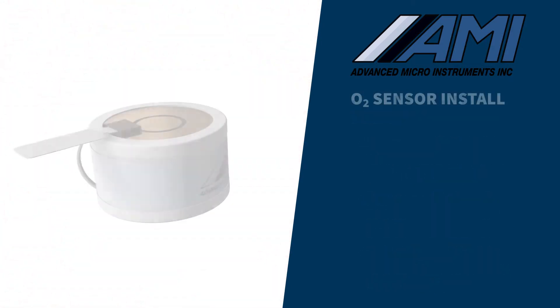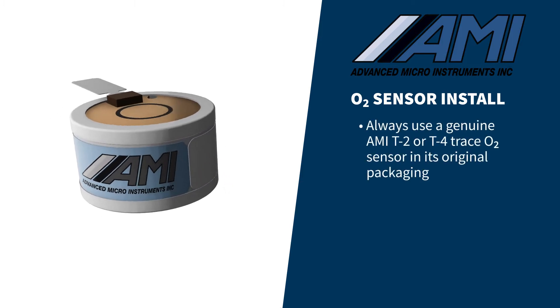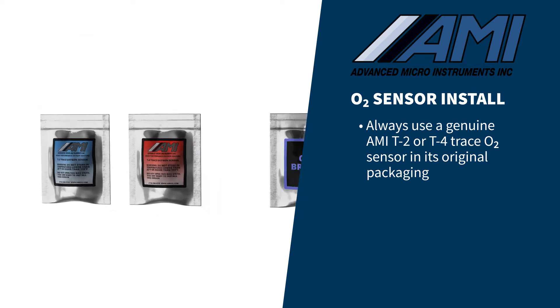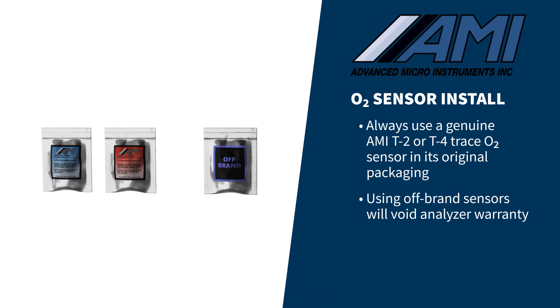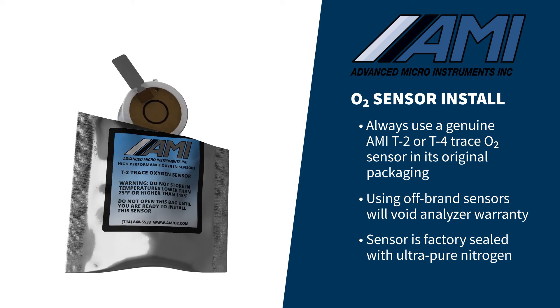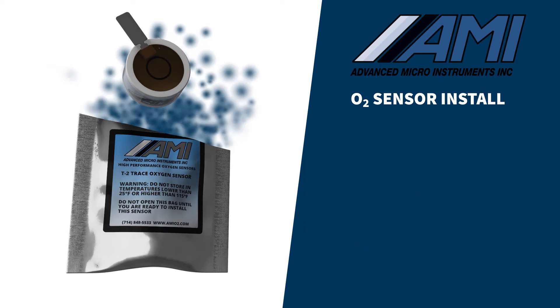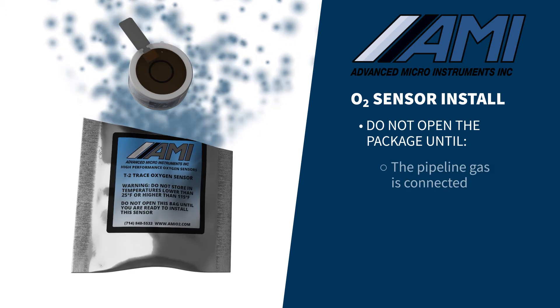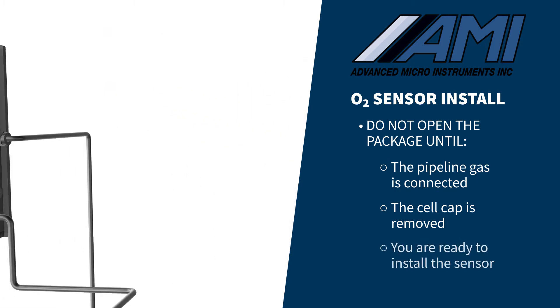For a new oxygen sensor installation or replacement of an existing sensor, you must use a genuine AMI T2 or T4 trace oxygen sensor in its original packaging. Using another brand sensor will void the analyzer warranty. The sensor has been factory sealed with ultra-pure nitrogen to preserve its shelf life and provide a rapid comedown time during installation. Do not open the package, exposing the sensor to air, until the pipeline gas is connected, the cell cap is removed, and it is time to install the sensor in the analyzer.